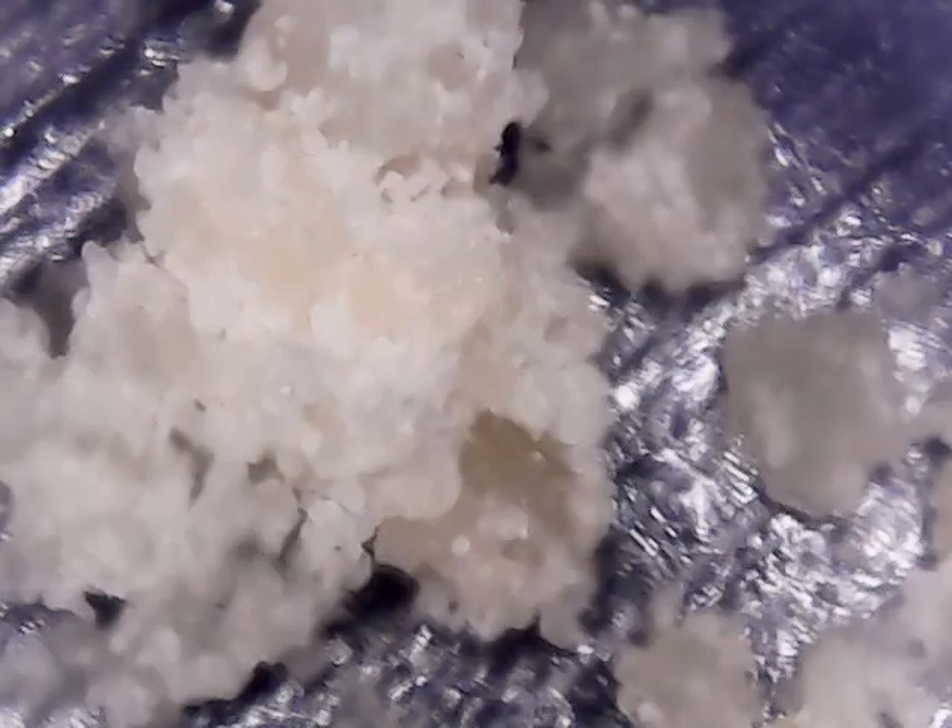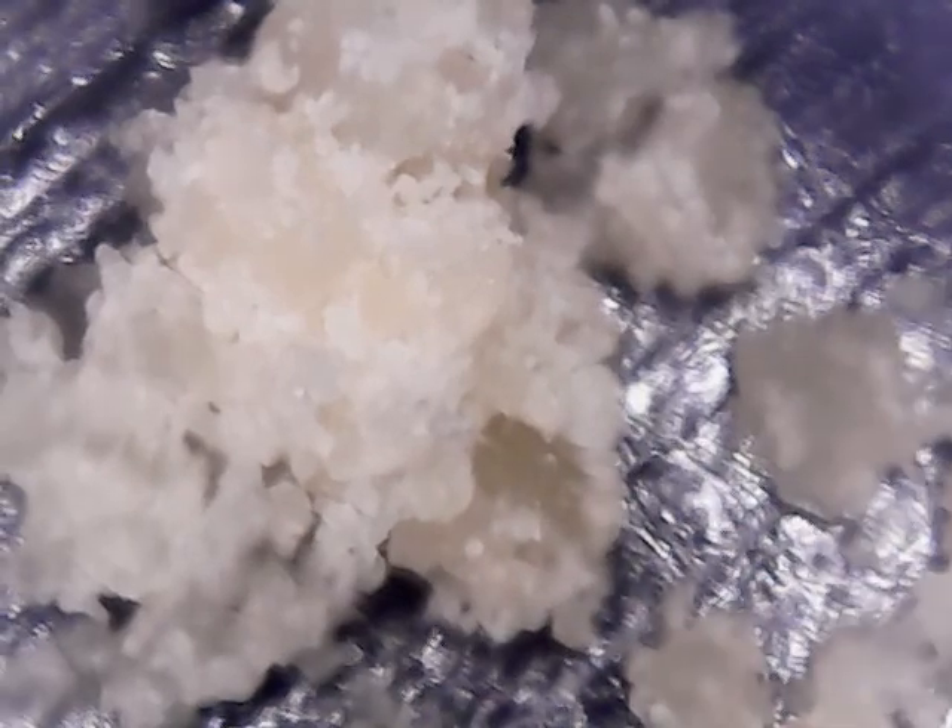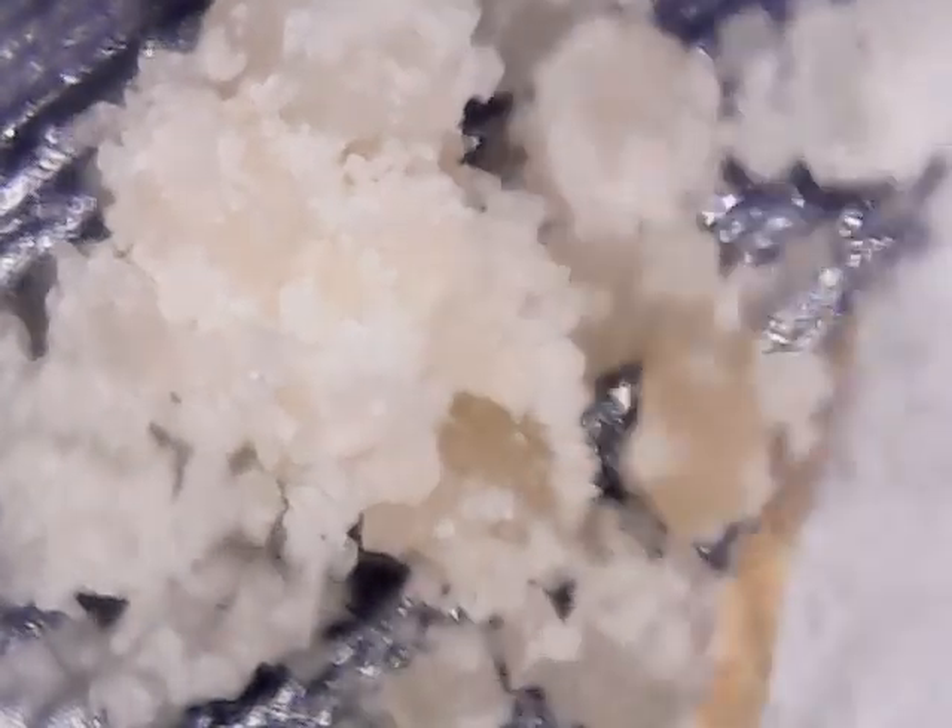This video might be a little bit interesting for the same reason as the cornstarch, because there's a lot of water under that microscope and I'm getting some grated Parmesan cheese. And it's open now, let me just get it a little bit under there. Holy cow, that's interesting. That is interesting.